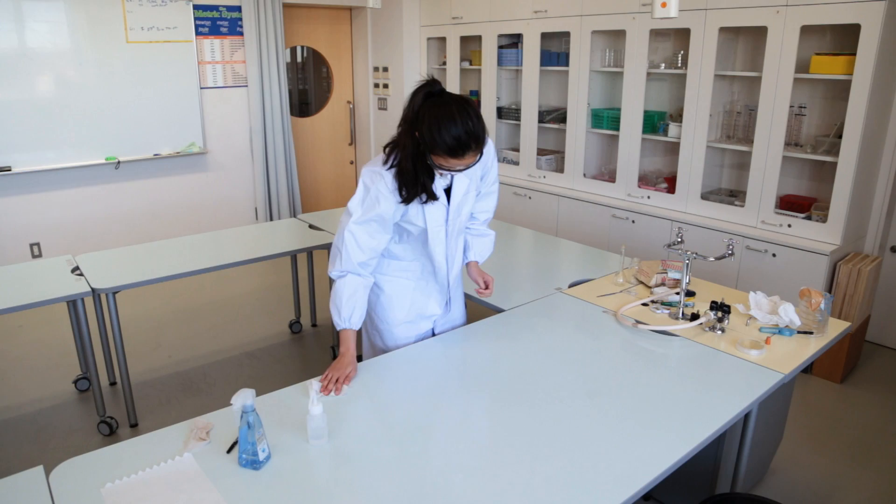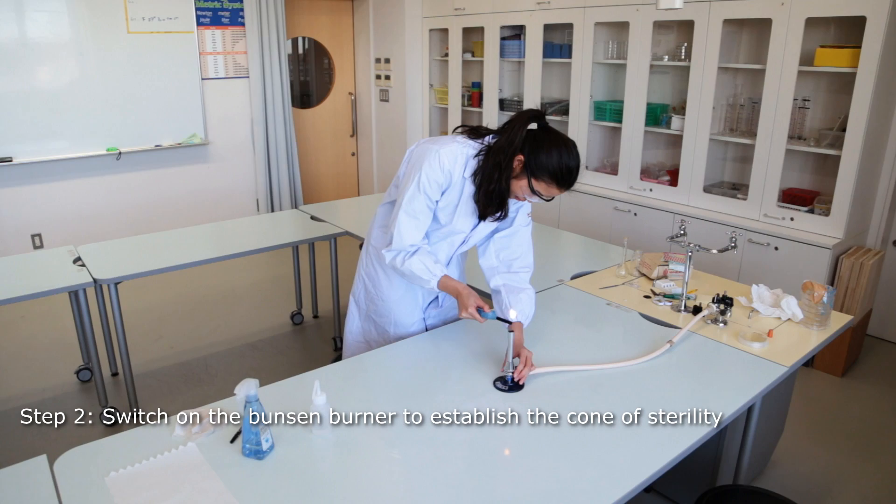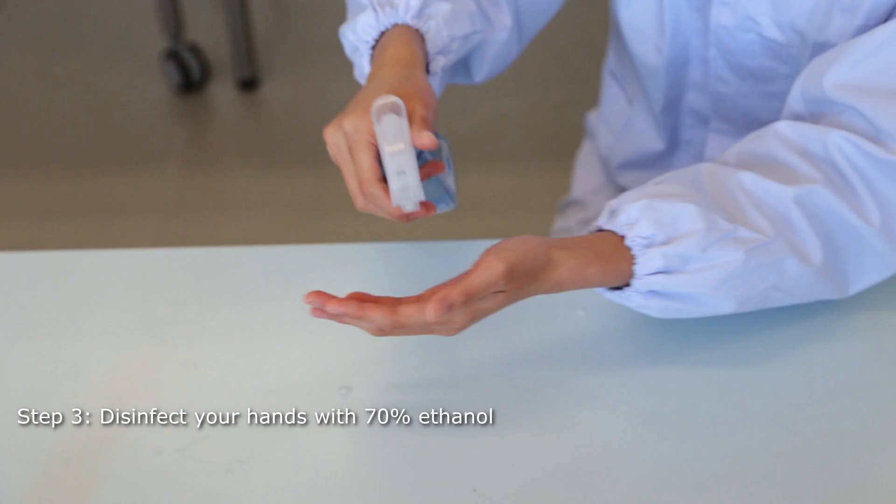Light up the Bunsen burner to establish a cone of sterility. Hot air creates an upwards current that prevents airborne contaminants from falling on your work. Make sure you conduct all of your sterile work within that zone.